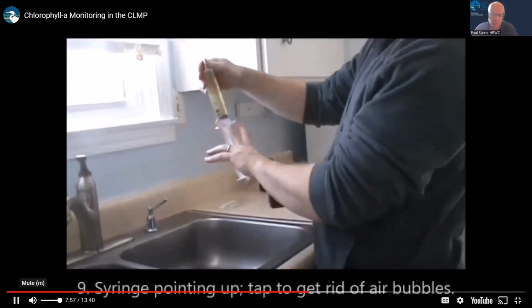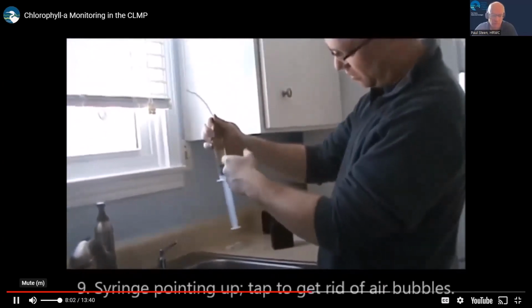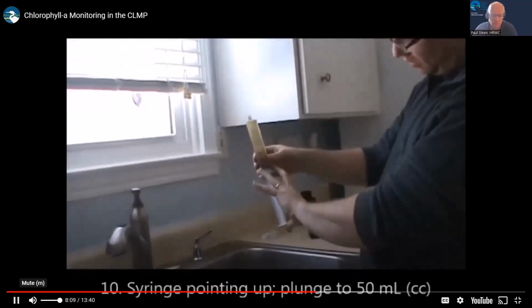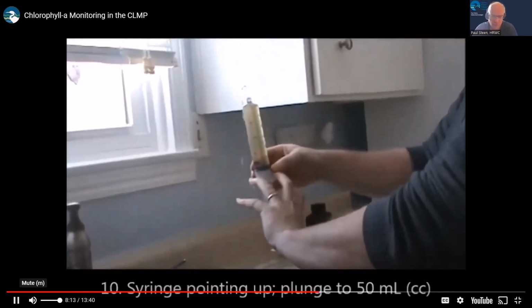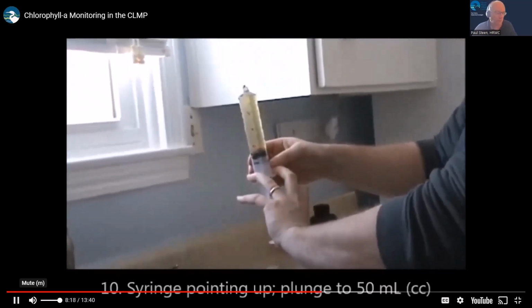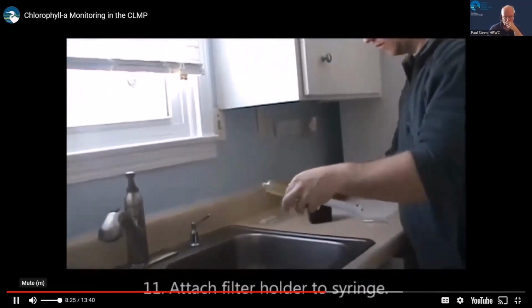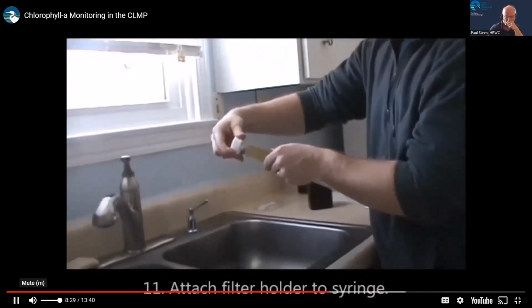With the syringe pointing up, tap it to force air bubbles to the top. Push the syringe plunger until the end of the plunger is lined up with the 50 milliliter mark. Attach the filter holder to the syringe. Like the tubing, it won't snap into place, but you can get it to fit snugly.